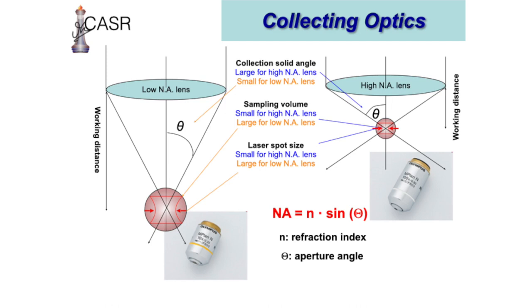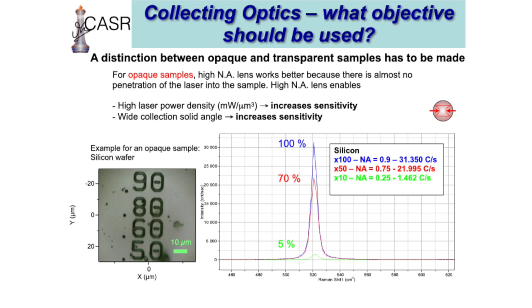That's the other thing which you need. If you look at the confocal fluorescence spectrometer, you will see the confocality depends on the focusing power of the system. Now, if my sample is transparent and my sample is opaque, which one should I use? Should I use a very high focusing system or less focusing system? This is another question people ask.